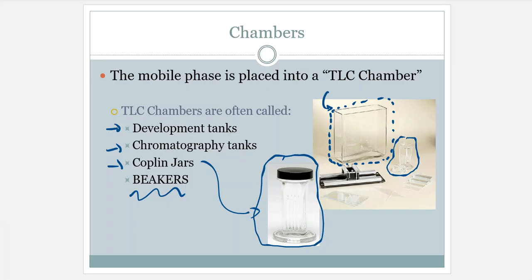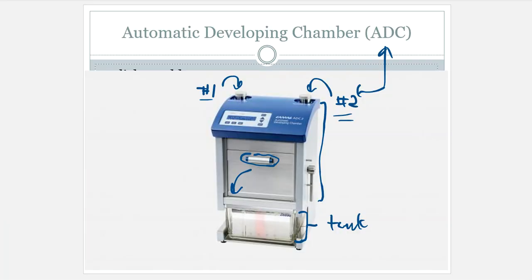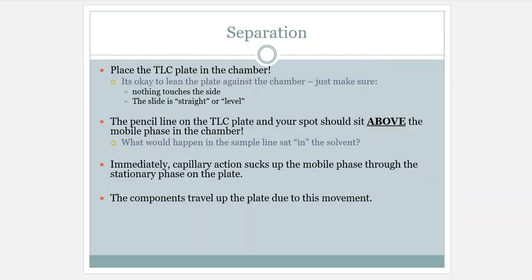So that's great news with our automated tank developer. That is one of the reasons that we want to use them. We want things consistent. We want things not damaged. We don't want things to come in contact with the plate surface and the silica. And it's one of the ways that it accomplishes the task. All right. When you place the plate in the chamber, a couple of things that you want to remember. Don't touch the sides.